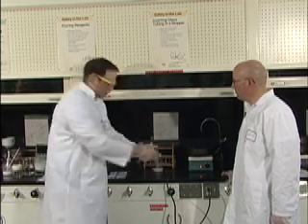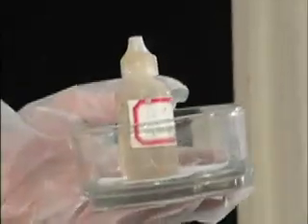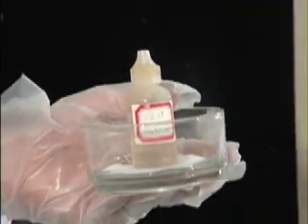Now you'll notice that in each of your fume hoods there is a dissecting jar with this 12 molar sulfuric acid in it, with a piece of paper in the bottom. We want to keep this inside the dissecting jar. Okay?